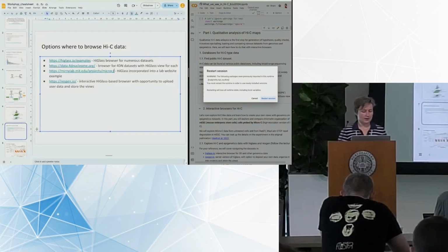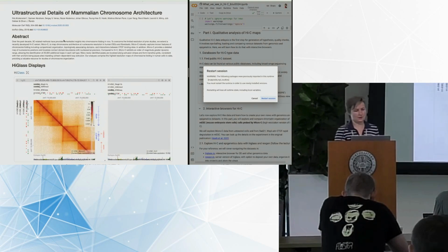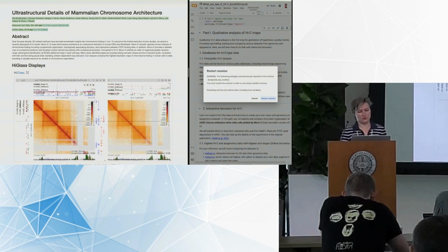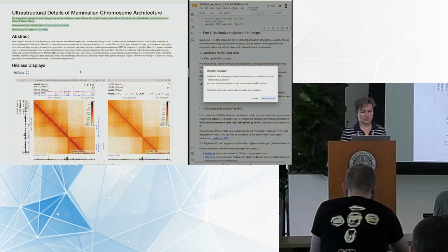Okay. HiGlass has the advantage that it can be indeed incorporated into a website. And for example, in our lab, we utilize this property. In the third link here, you can find our lab website where we have one project where our collaborators generated some data, we analyzed it, and now we put it as a linked view within our website, which is very handy, and you can associate useful information from the published paper together in a nice interactive view that you can browse and learn more details about the published dataset. So this I find very, very useful and helpful.